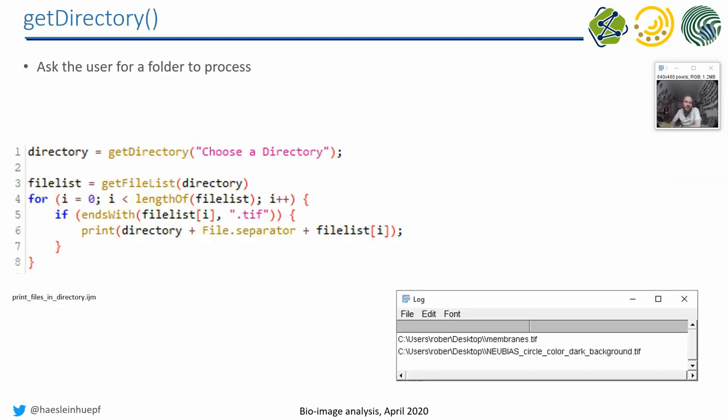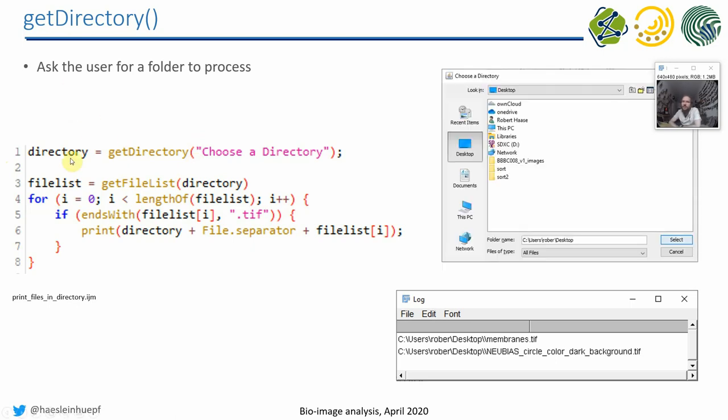The most simple way of doing it, if you, for example, want to ask the user for a directory, you just use the getDirectory method. And when the program is executed, it will open this dialogue. You'll find actually the string you write here, you'll find them here in the headline of the window.